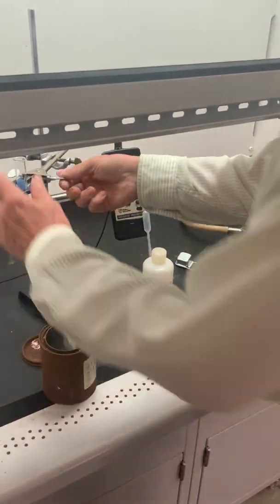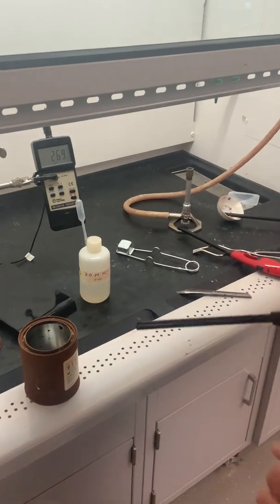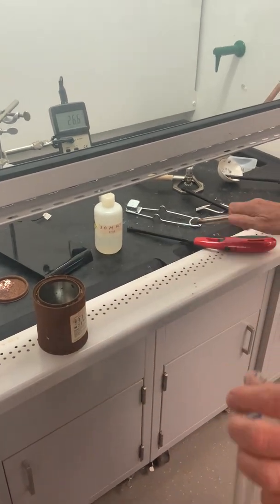Same reaction. I'm going to pull this one out of the fume hood. Which one of these was working? Make sure you don't hold on to that one. You're going to burn your fingers. Yeah, that's why I got a big one, so I can hold it high.